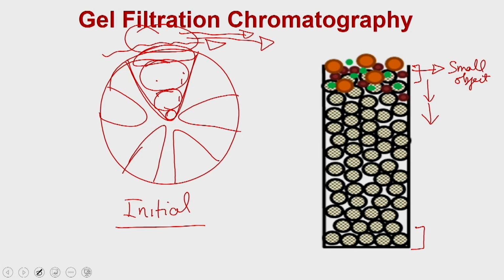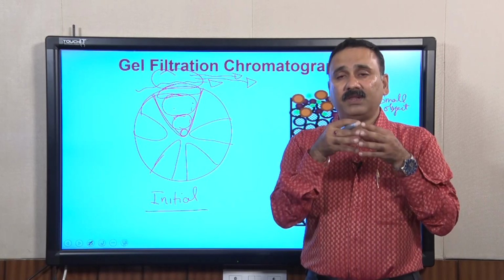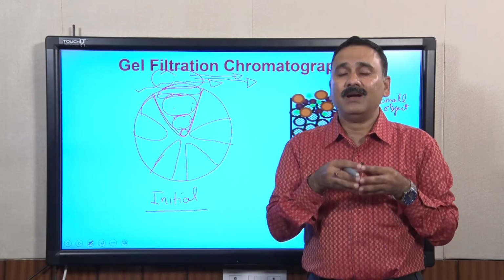So, if you have a confusion that every bead is going to have all of these molecules arranged in its pores, then that is not true, because the dynamics of these molecules are very different. Because of their sizes, the dynamics of the small molecule is going to be very large.